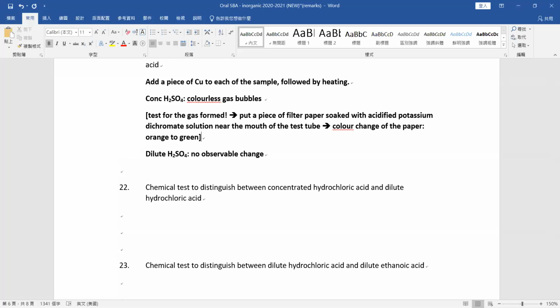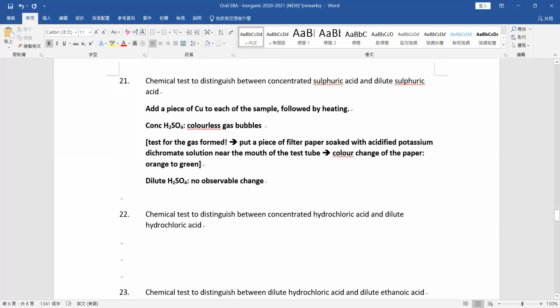Now, indeed, in the practical sense, you may see the difference between the two acids, right? One of them is oily, one of them is watery. Now, this afternoon, be aware of it. Concentrated sulfuric acid is oily, dilute sulfuric acid is watery. And if you stick to yesterday's method, putting a piece of paper into concentrated acid and dilute sulfuric acid, it is also possible. This time, do you know why?